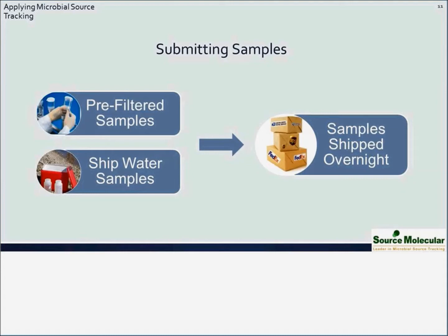The way many big projects are doing it now, though, is that you can have the local laboratory that's doing your routine monitoring filter the water samples. And so these pre-filtered samples can be stored, frozen locally, and you could take your, whatever it happens to be, 100 samples a year, filter a subset of that water, and then store it. And then you say, okay, well, we only frankly have the money to test 20 or 30 of these samples with the more expensive source tracking tests.